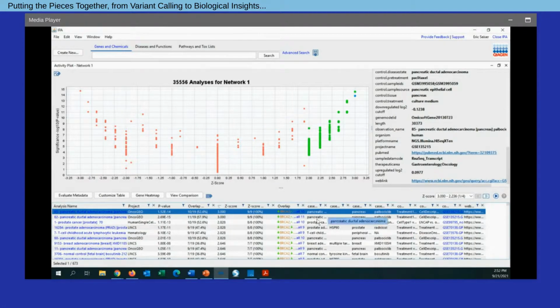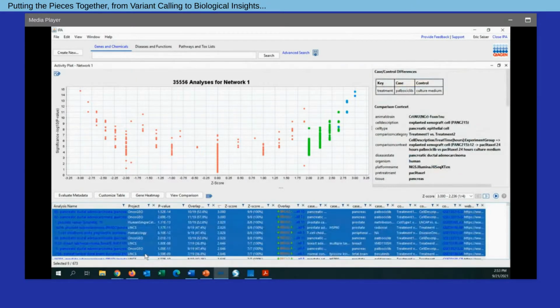Now, I can then go through this list. There are many scenarios where we see similarity, but one overriding theme that I observed when looking at this is that many of these studies show treatments with some kind of compound that induces DNA damage. So it makes sense, and again, most of these are cancer-related studies. Now, the last step here would be to select any number of studies that I deem relevant. I can just select them within the table.